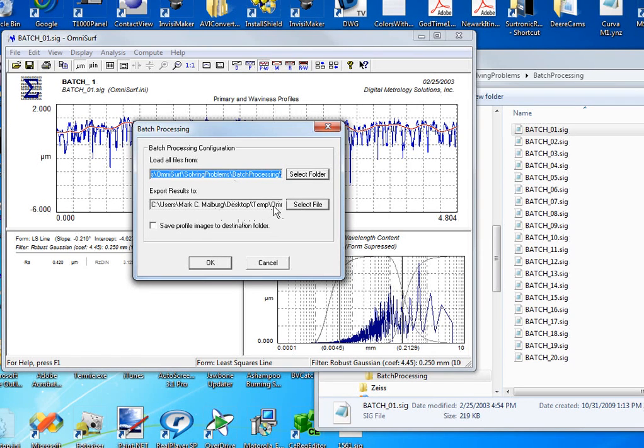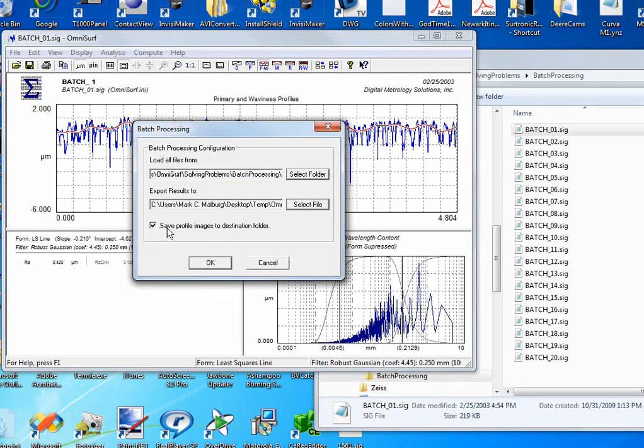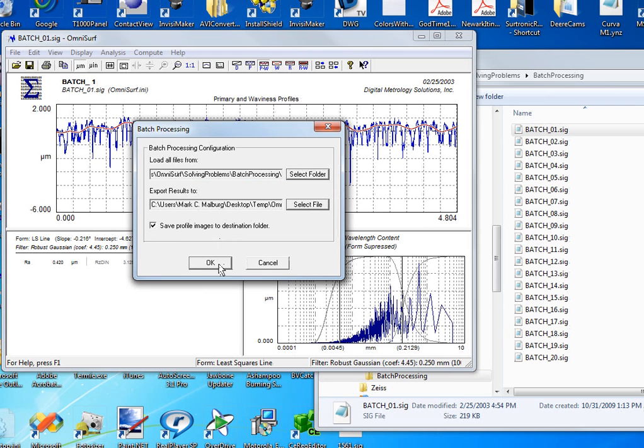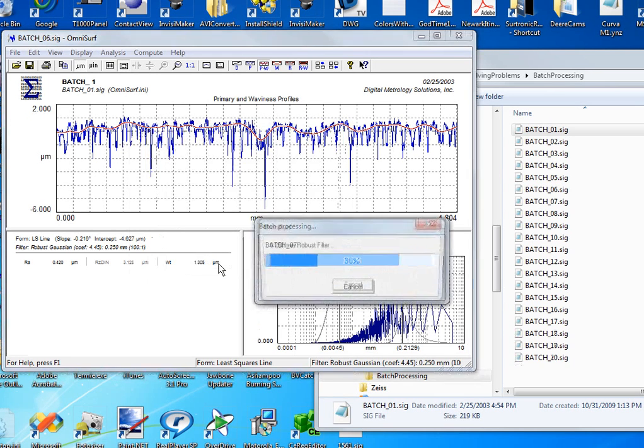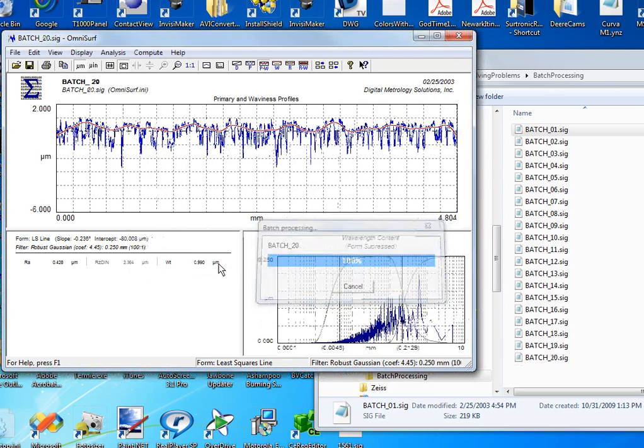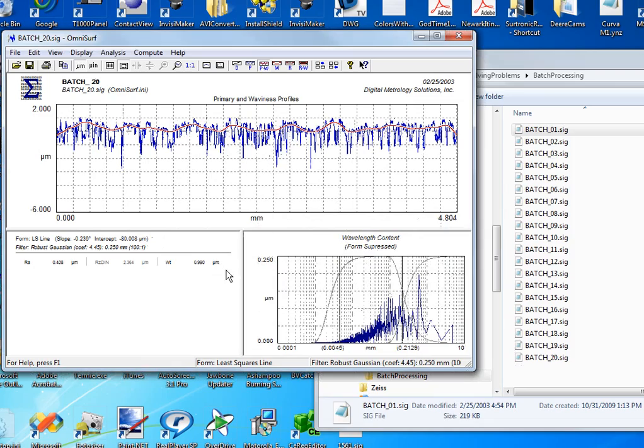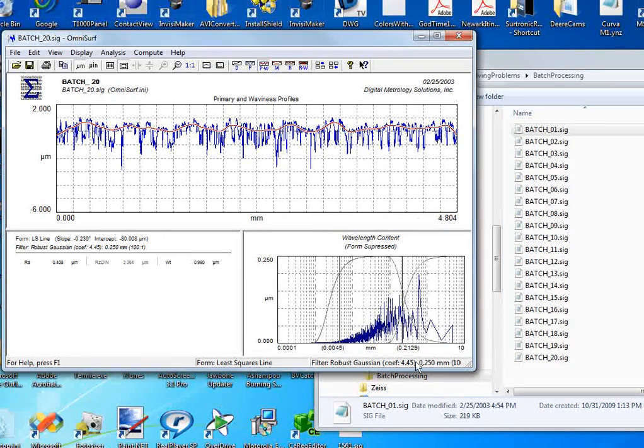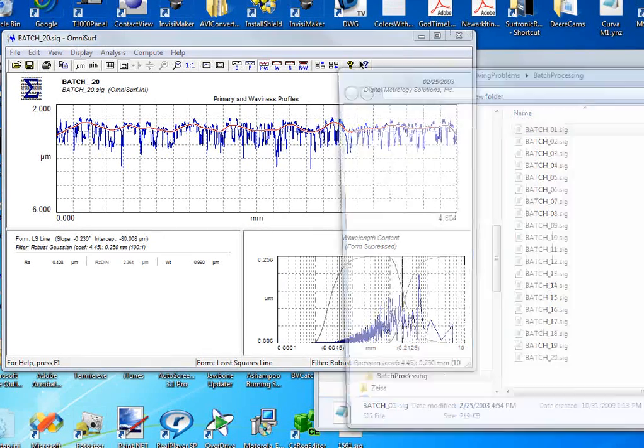But here's something that is really new and I'm quite excited about. This is new in version 3.12 of OmniSurf, the ability to save profile images to the destination folder. So I've turned that on and I'm going to fire off my batch processing, and you'll notice it'll take a few milliseconds longer, but check this out.